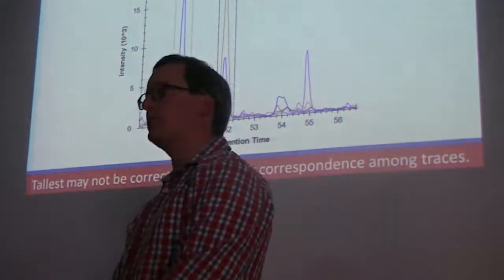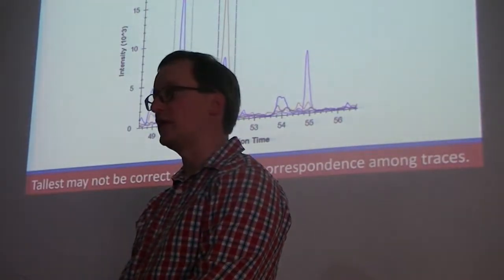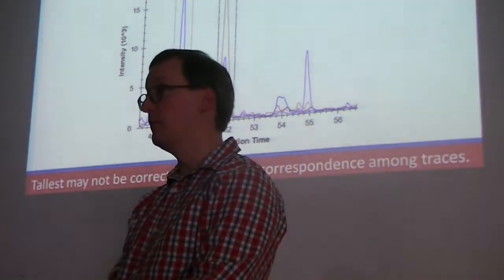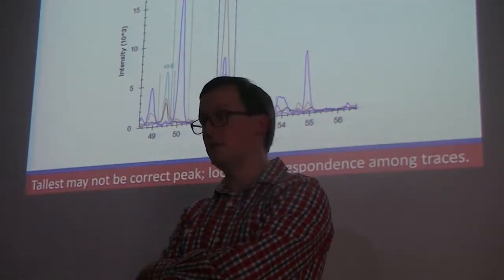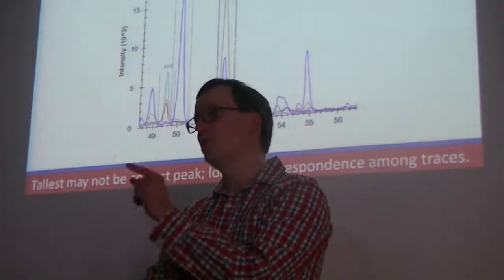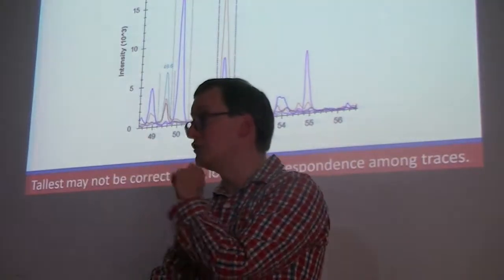Do we have a triple quadrupole mass spectrometer at Stellenbosch, Tygerberg? Anyone ever been over to the proteomics lab? It's on the 6th floor of the clinical building. Marne Flock is a very interesting guy. He had a lot of interesting things to say. But in fact, the proteomics laboratory at Stellenbosch, at Tygerberg, does not have any triple quads.